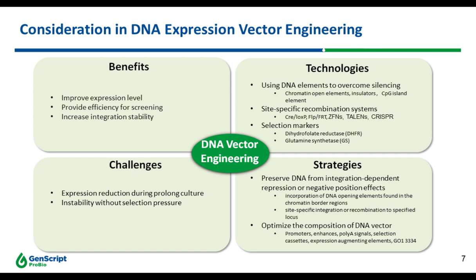For cell line screening technology, there are namely five commonly used technologies. I say commonly used, but actually the Beacon was only newly developed recently. The most commonly used are probably limiting dilutions. They are low cost, easy to operate, with low cell damage, and do not need sophisticated equipment. But their disadvantages are low seeding efficiency, large workload, and a higher probability of contamination.